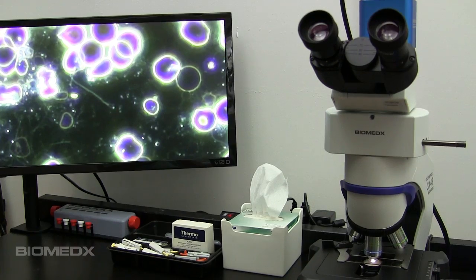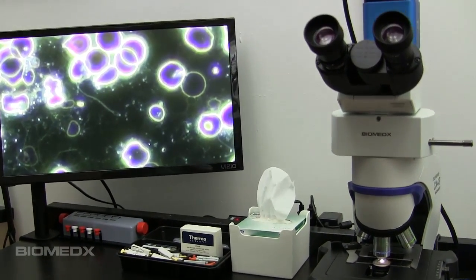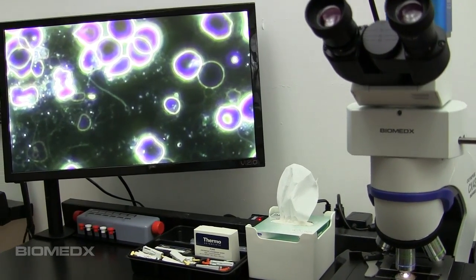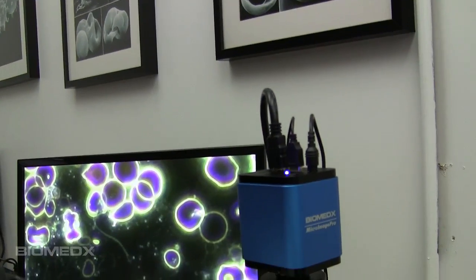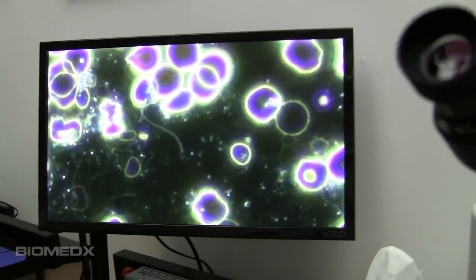Here we are just looking at the Biomedics system — the Biomedics configuration of the Olympus system — in dark field view, zoomed in quite a bit, again with our camera here that has the digital zoom function, which is actually very clean.